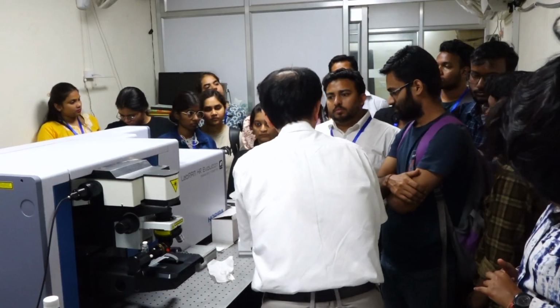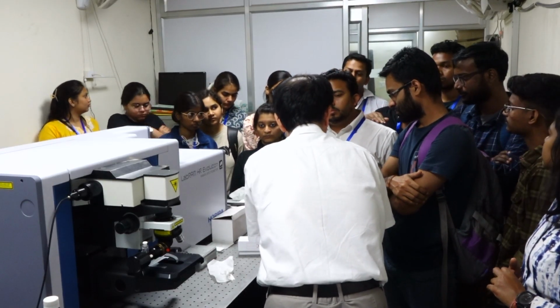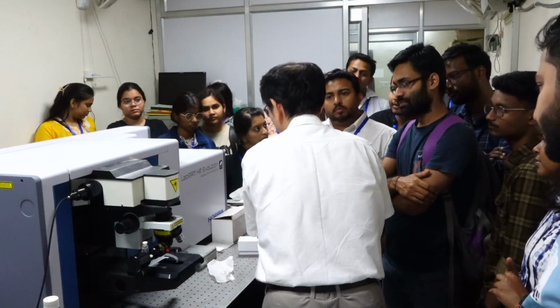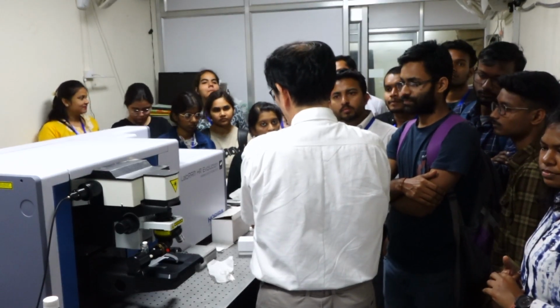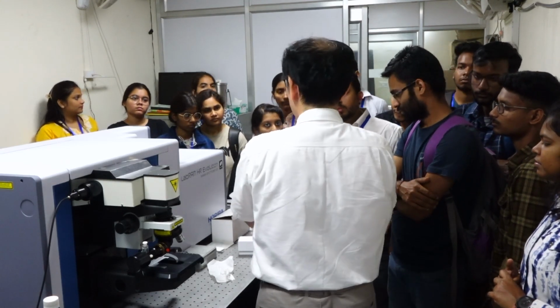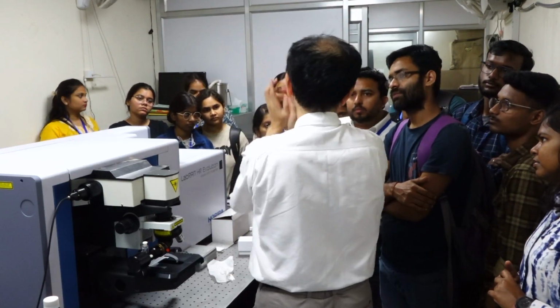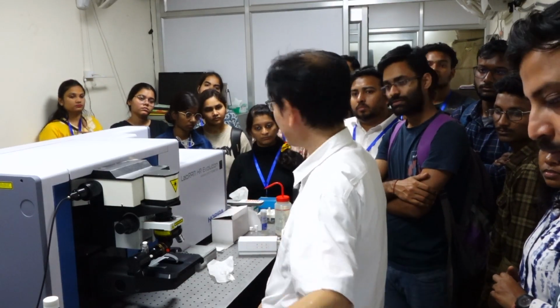Like we used to do in the UV spectrophotometer, we have to set a baseline correction. Do we need to do it here again? Baseline correction, as necessary. There are many reasons that affect the baseline, for example, room light or some display light.